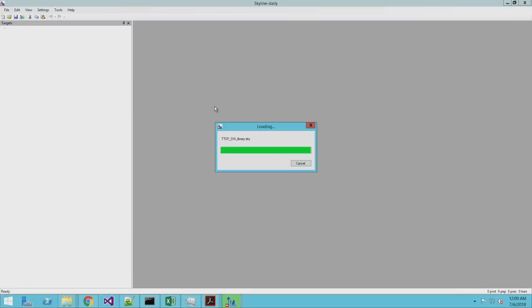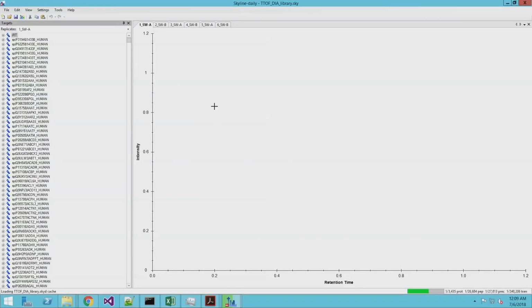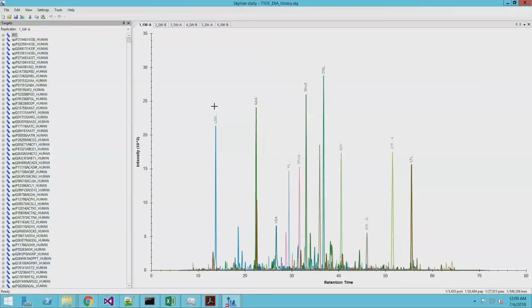Yes. Whenever I see the histogram of the mass errors, I was wondering, so MaxQuant corrects for this mass error, right? Or tries to at least, to get the sub ppm accuracy. Is this also possible for Skyline? It's not something that Skyline does. And the mean is always not centered on 0, right? So you could shift this at least, or work with that. Yep, definitely. And it's something that I thought about, and I actually had a parameter in the command line that would do that when we ran into one of these problems, but not something that we've done yet.